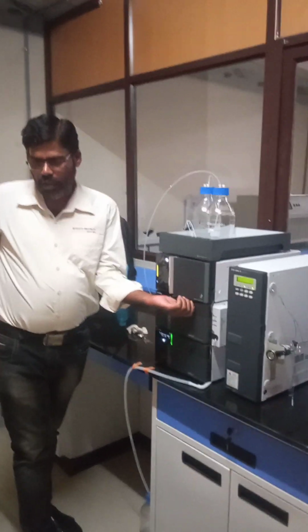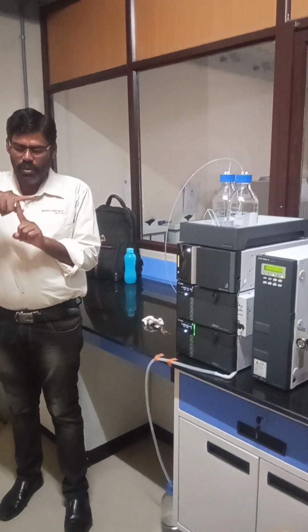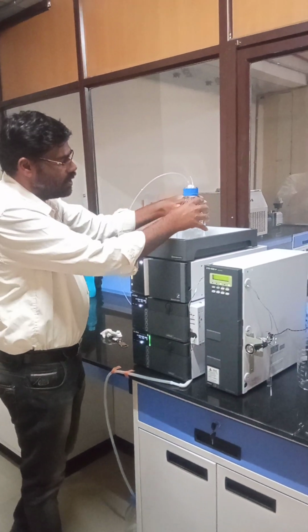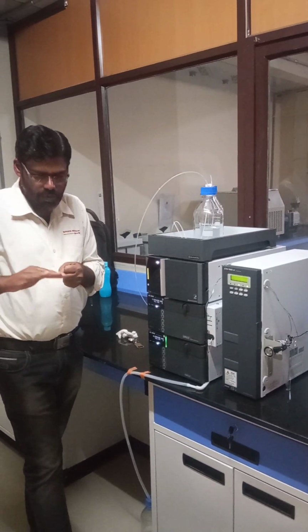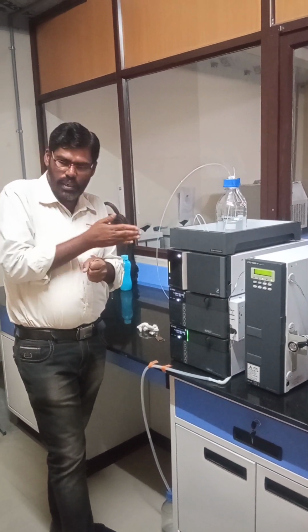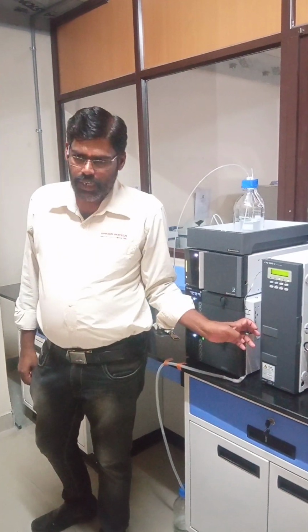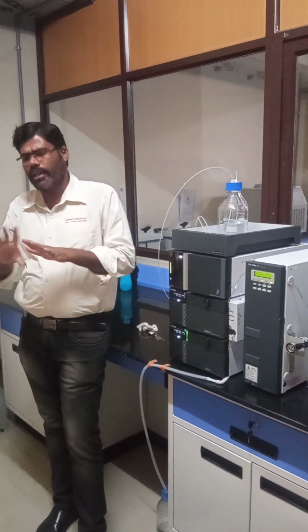What does 30% water mean? For example, with a 1 ml flow rate, 30% is the water and 70% is the organic solvent. These two bottles are there: A sucks 30%, B sucks 70%. If I run only 100% water, there is no peak. If I run 100% organic solvent, everything will merge and elute fast. It should always be a combination, so these two mix in the mixer. That is the main reason. One bottle should be water and the other methanol or something else.